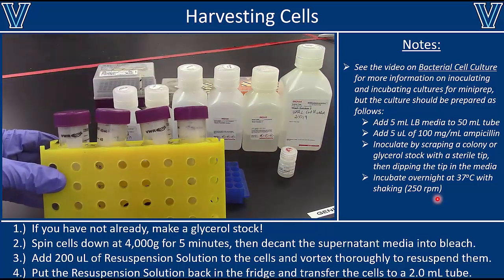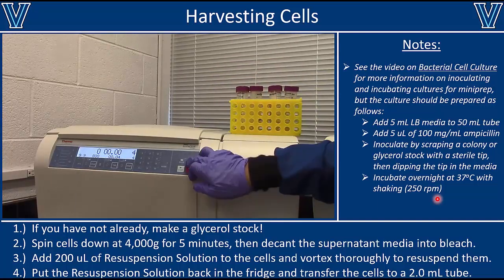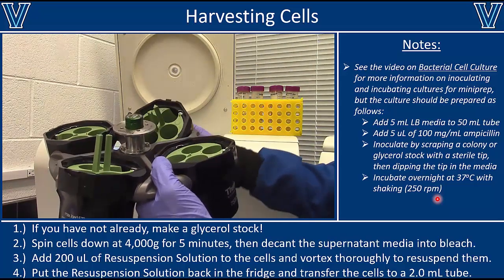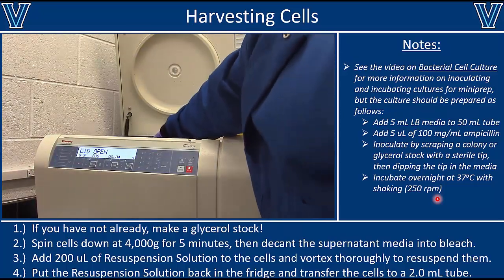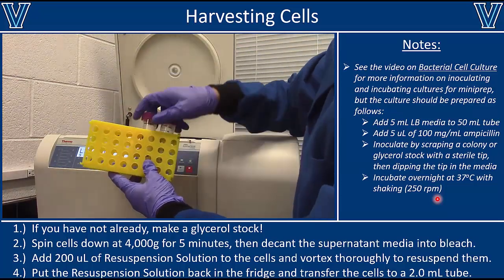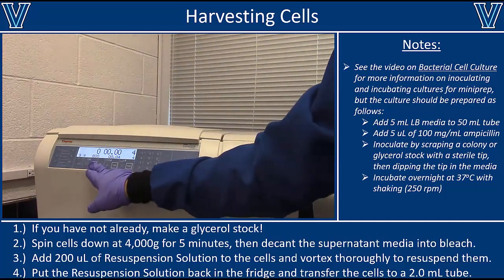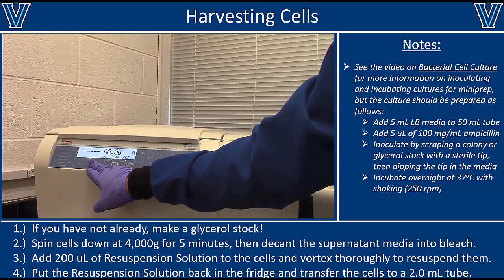So we're going to take our bacterial samples over to the centrifuge. And then we're going to spin them down at whatever G force and time it takes to get a nice tight pellet. In this case, I'm going to be using a swinging bucket rotor with 50 ml adapters in this centrifuge. And the speed for that will be around 4000 G for 5 minutes. I want to take my 50 ml tubes and place them opposite on the rotor to make sure the centrifuge is balanced. And then, like I said, I'm going to change the speed to 4000 G.